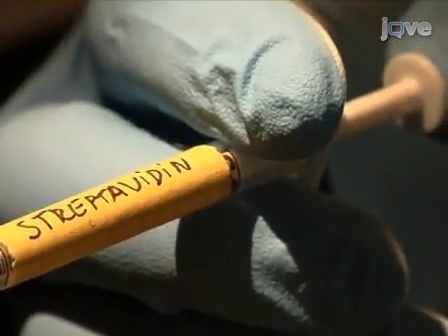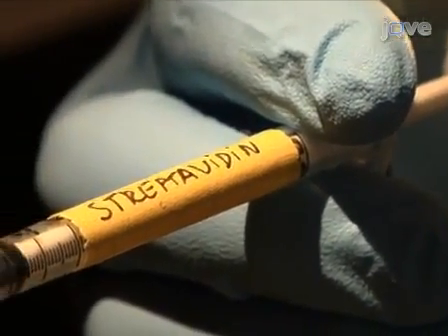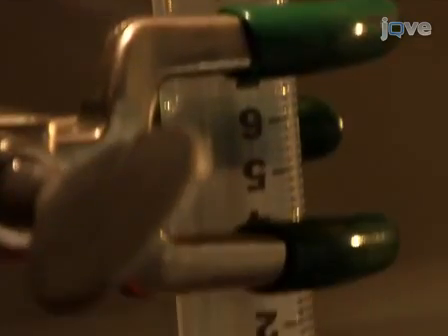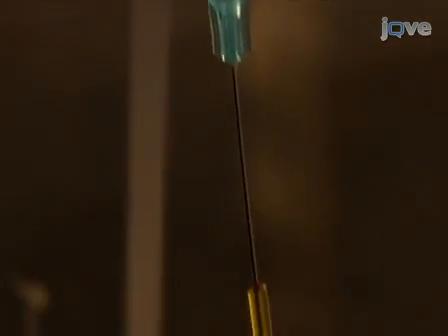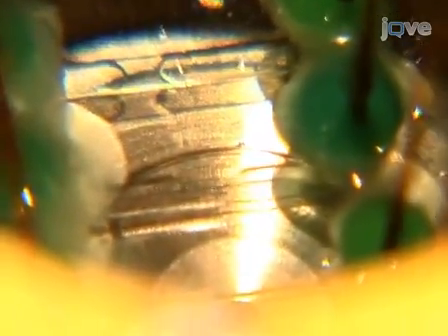Next, inject a solution of 0.1 mg per milliliter streptavidin in buffer A and incubate for 15 minutes. After the 15-minute incubation, flow 300 to 500 microliters of buffer A to remove any unadsorbed streptavidin from the channel. As before, avoid trapping any air bubbles in the chamber.